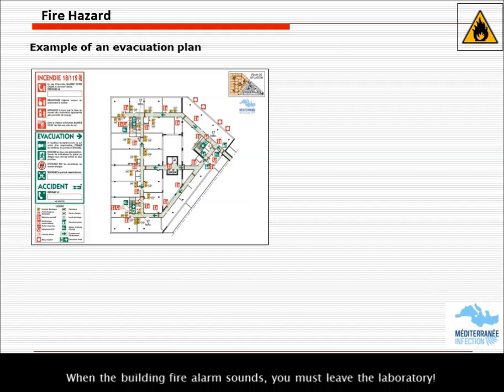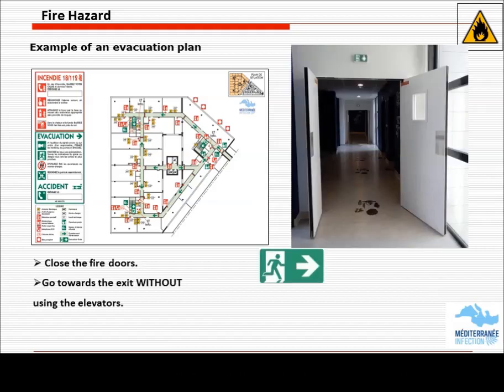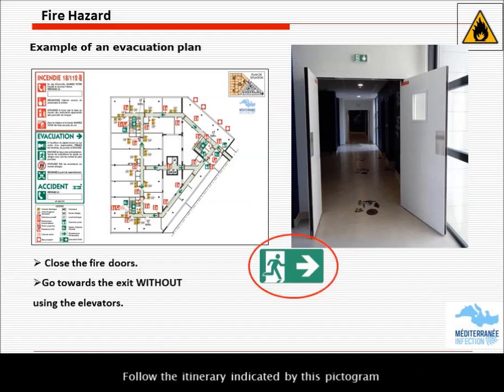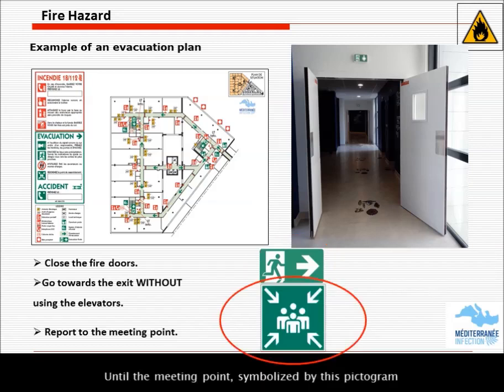When the building fire alarm sounds, you must leave the laboratory. Secure your handling, close doors and windows if necessary, and calmly head for the exit without taking the elevator. Follow the itinerary indicated by this pictogram until the meeting point, symbolized by this pictogram.